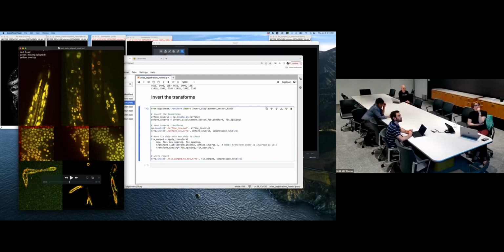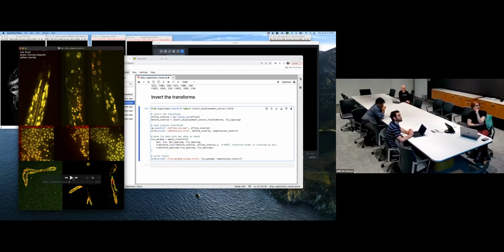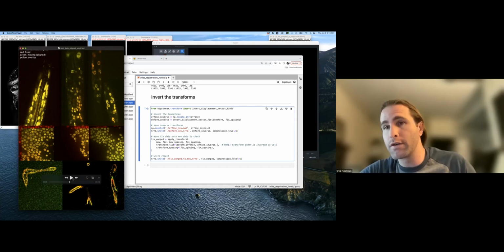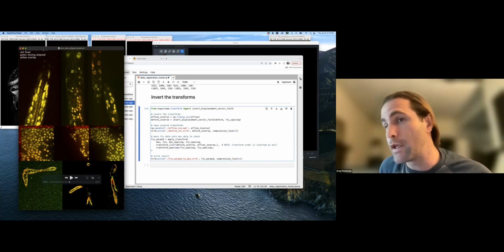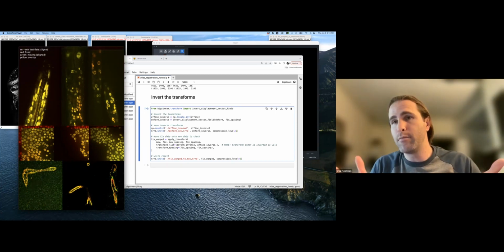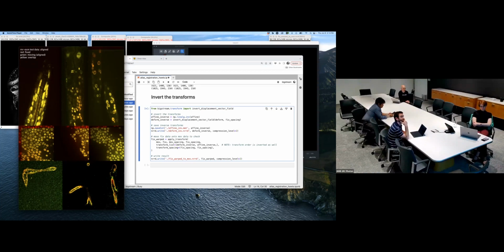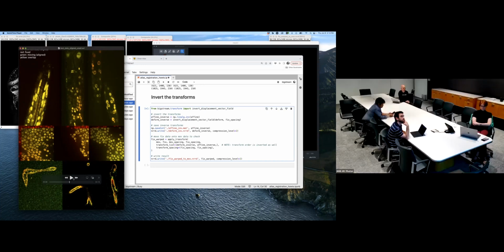You can tell from this speckle, the mouse data was pretty low quality data in a lot of ways. First, both the fixed and moving image for a lot of this mouse data had low signal to noise ratio to begin with. But second, and potentially more problematic, is that between the fixed and moving rounds, there was a lot of signal dropout. So in the moving round for these mouse samples, the features present in the image were a little bit different than what was present in the fixed image. And the nature of the intensity in the image, how objects appeared, was also quite a bit different.